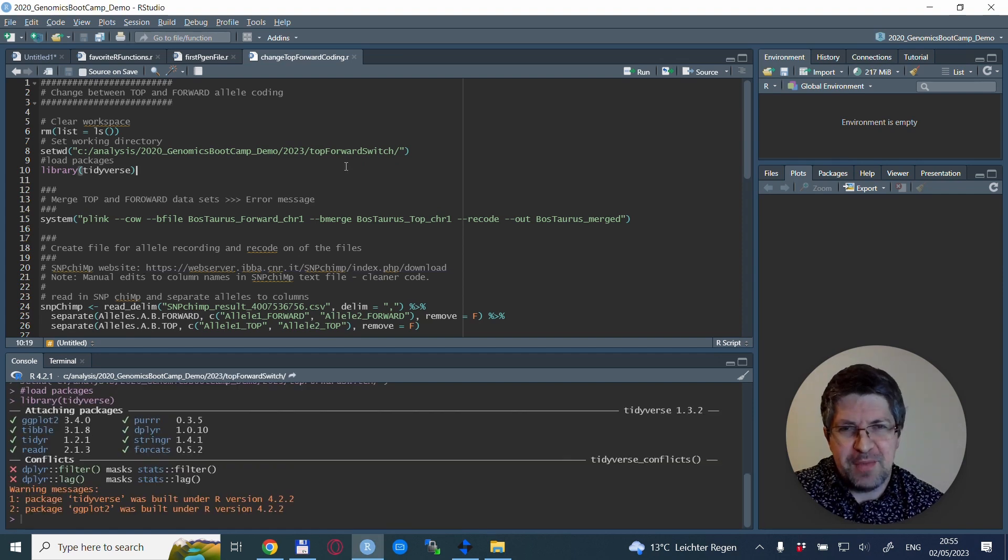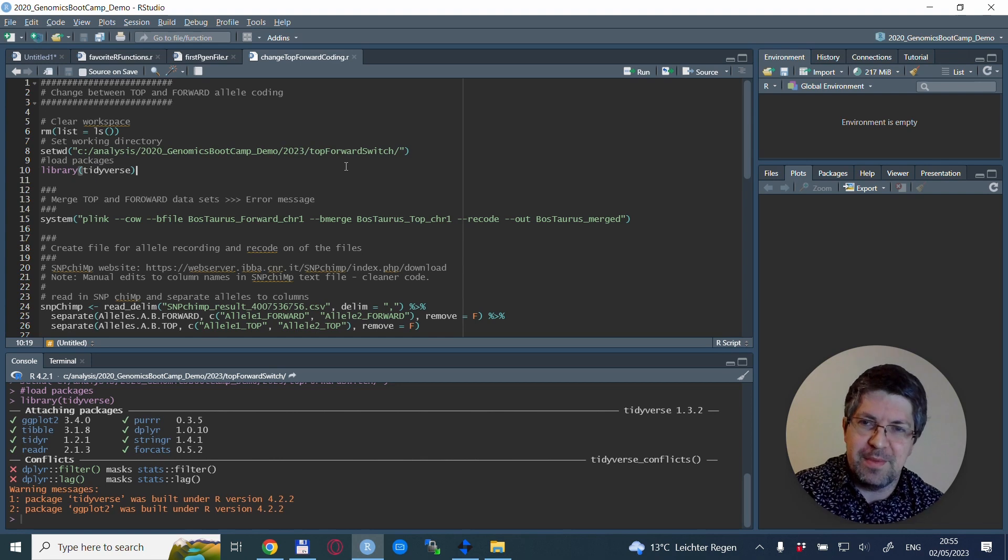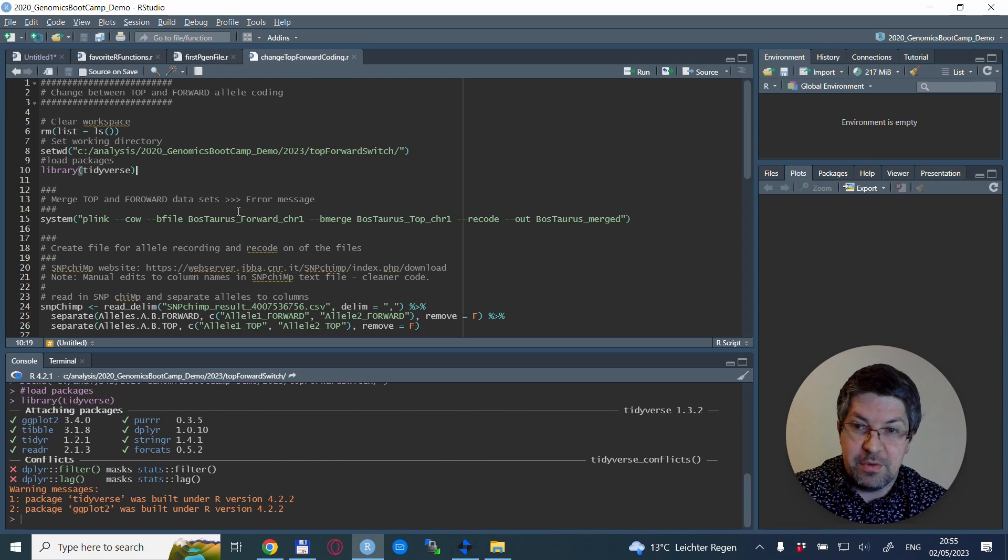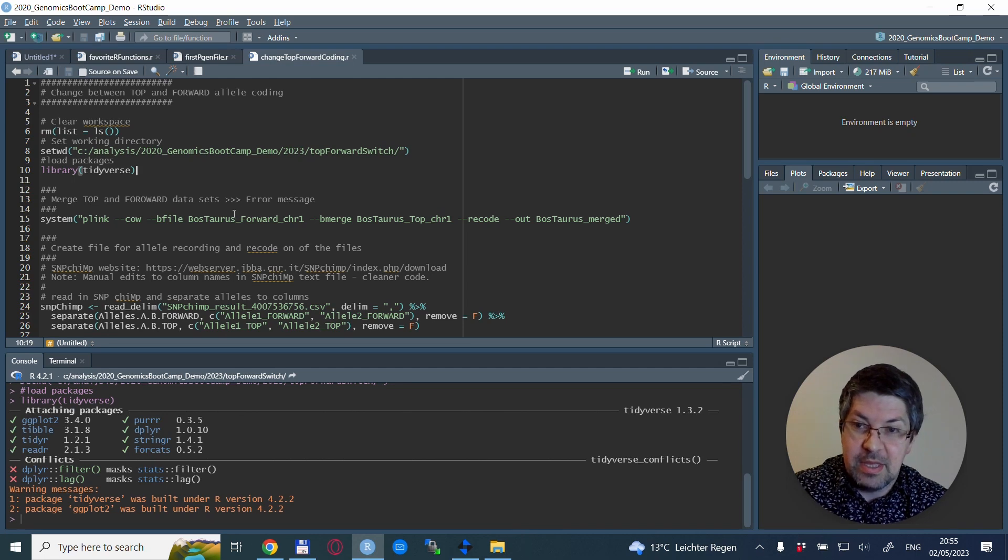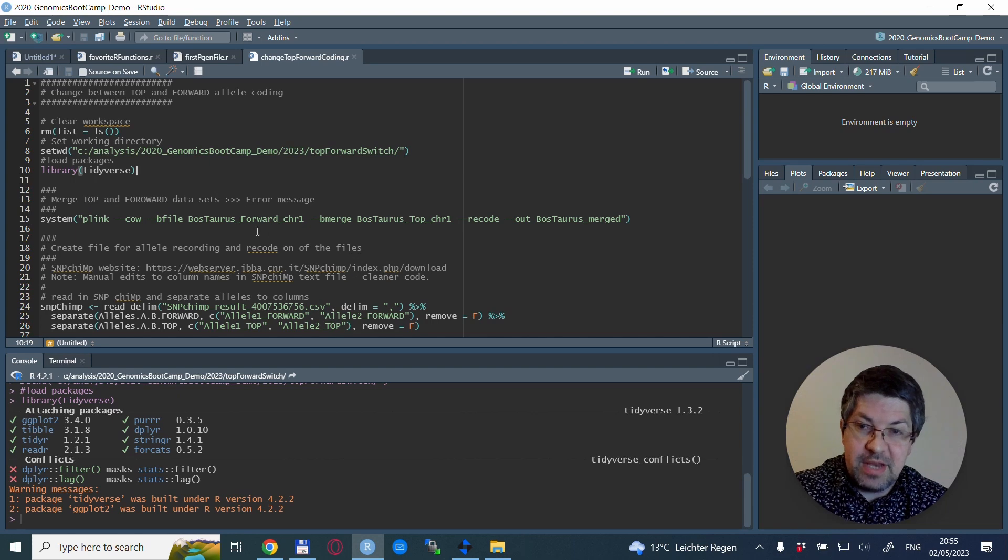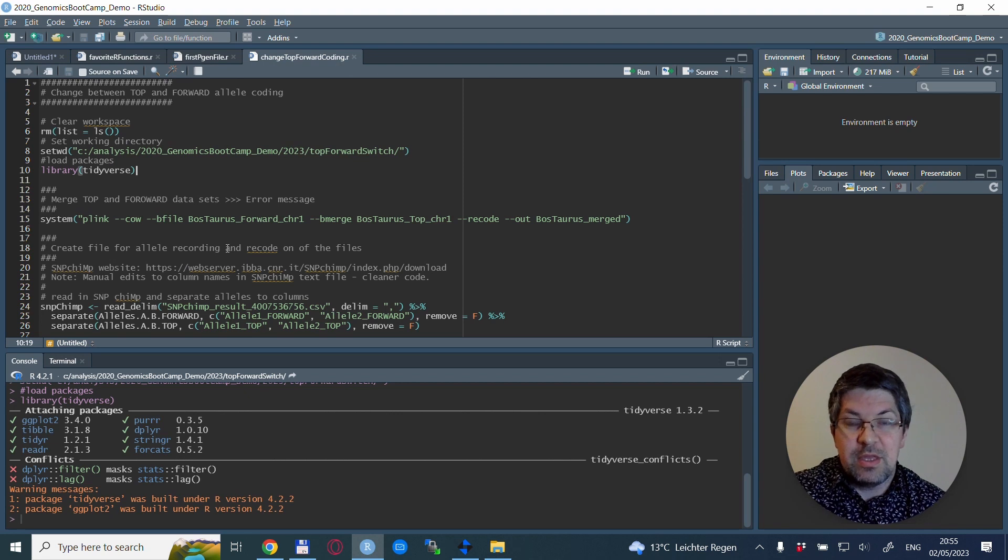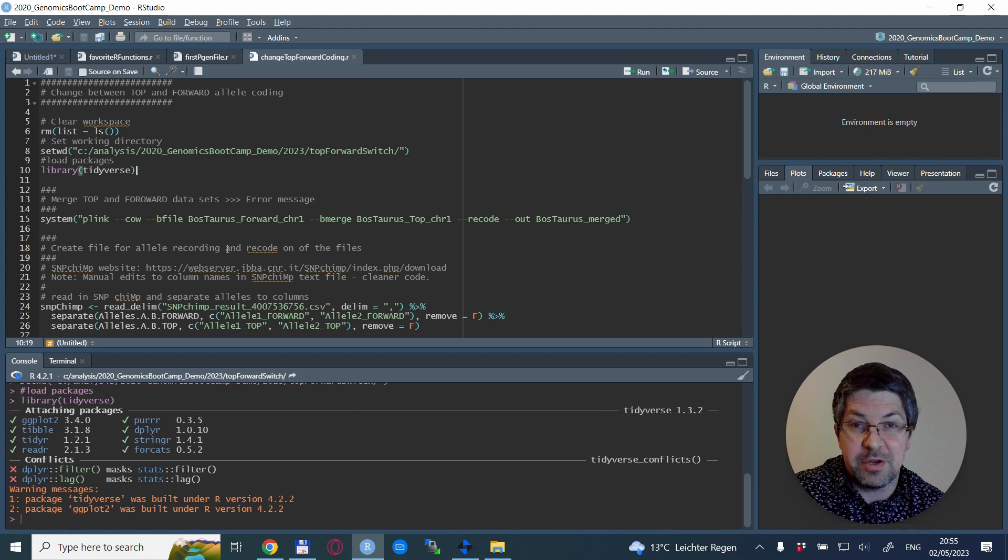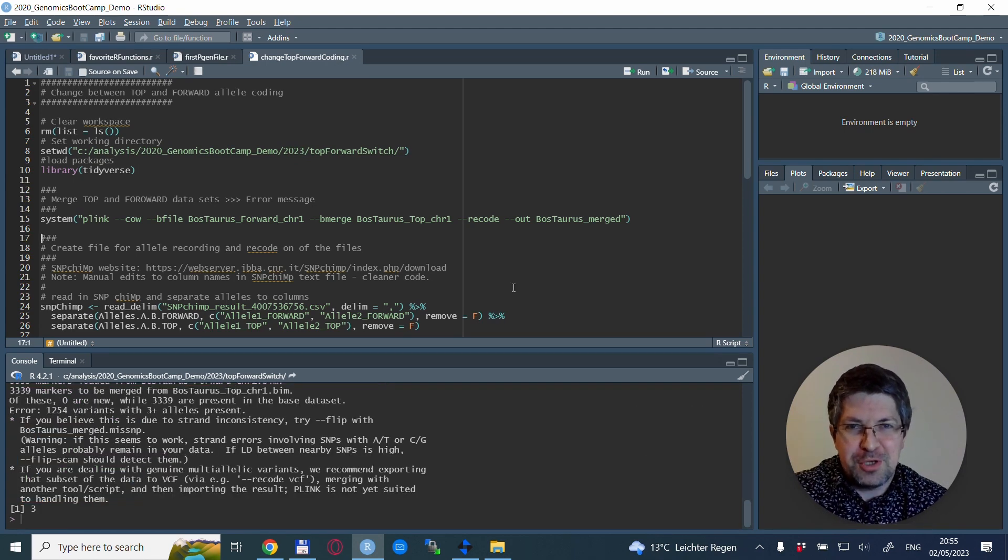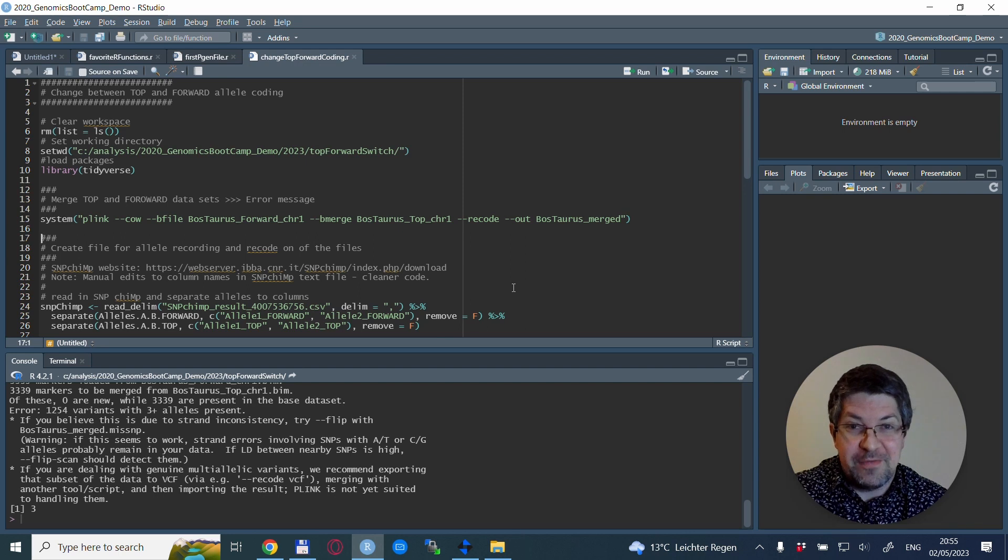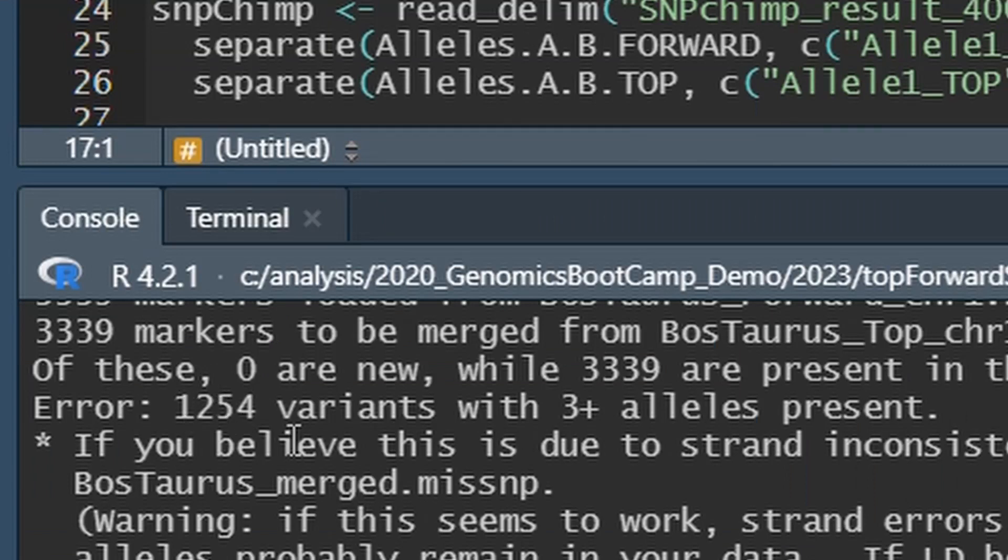Sometimes you have two datasets that you want to merge and it turns out that one is in forward coding and the other is TOP coding. I included the names into the file names so we know exactly what's happening, but normally you don't know until the merging. When I tried to merge, the following error message appears: the number of variants have three plus alleles present.